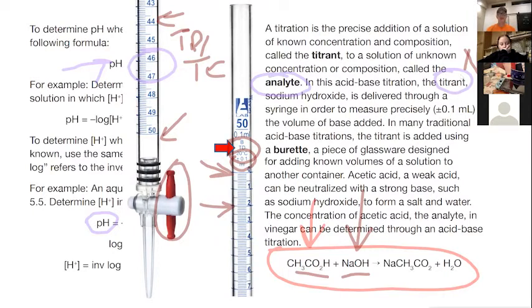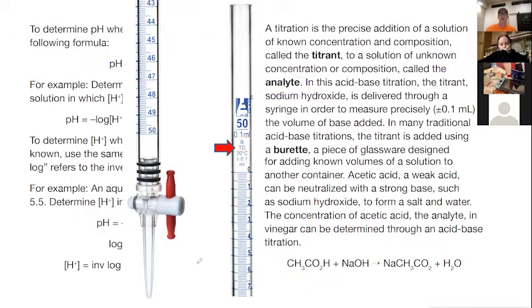We are going to be using a syringe, so we won't have nearly the precision, but you will find that if you do this experiment carefully, you will get really good results with it. For instance, I think last week I was doing the experiment with the other class, and we got 5.1% mass. That's pretty close to 5, if you ask me. So you can get excellent information. Not quite as good as it would be with a burette, but we make do.